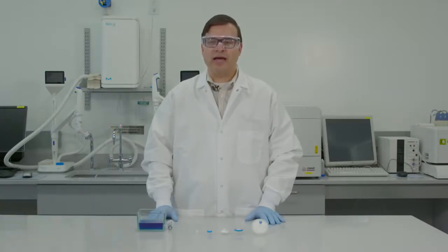Hello, this is Vivek Zoshi and today we are going to talk about differences between uni and bi-directional Millex syringe filters.